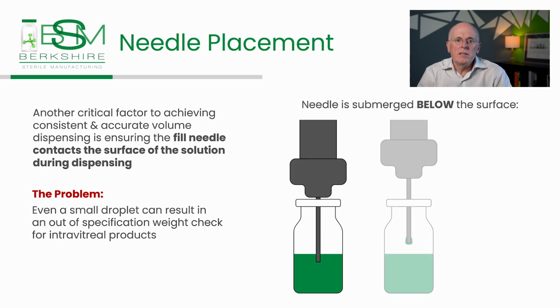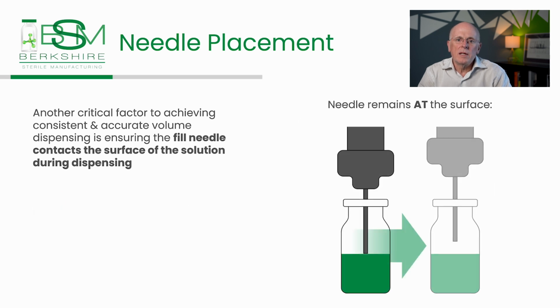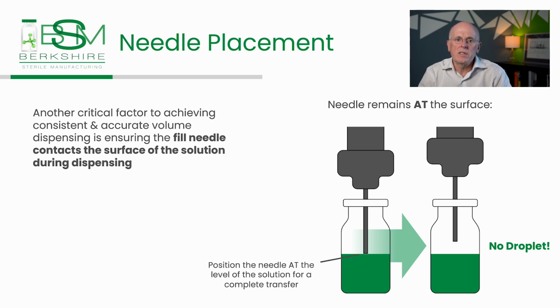On the other hand, it's important to avoid submerging the needle in the solution while dispensing. This can cause the drug product to stick to the outside of the fill needle, potentially leading to inconsistent weight checks for similar reasons described above. To ensure complete and consistent transfer of the fill volume without forming droplets, it's important to position the needle at the level of the solution.